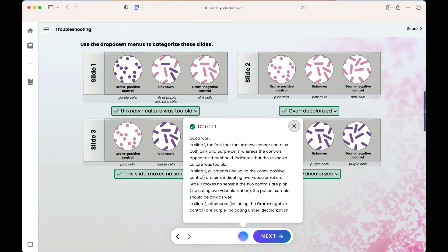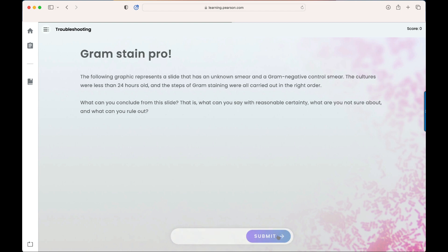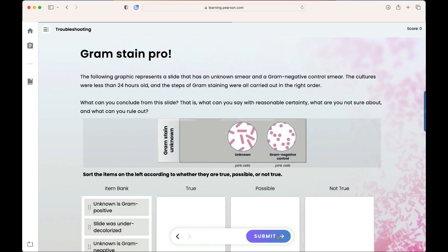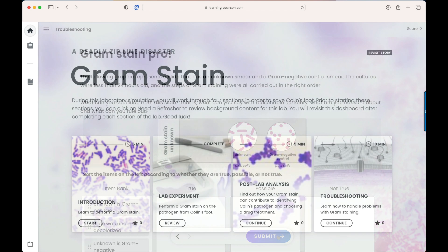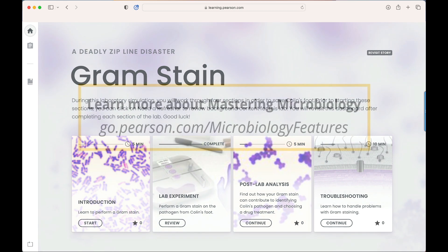Students will continue through the section in order to complete the entire lab and will conclude at the dashboard. And that is Pearson Interactive Labs for Microbiology.